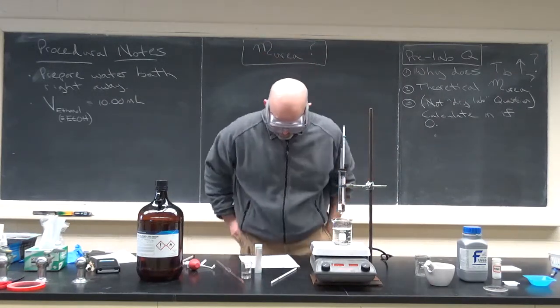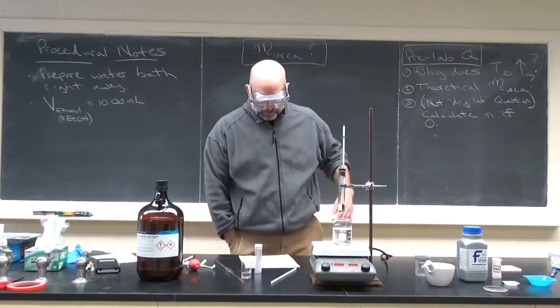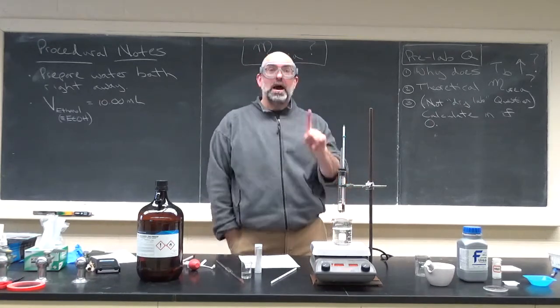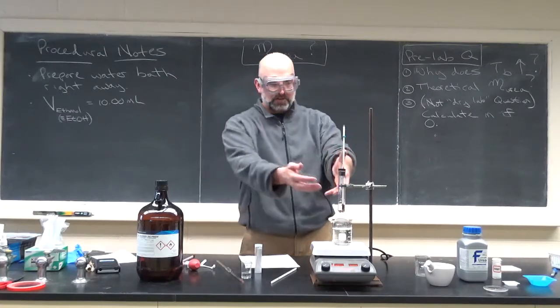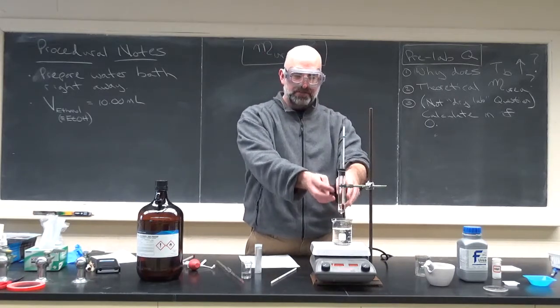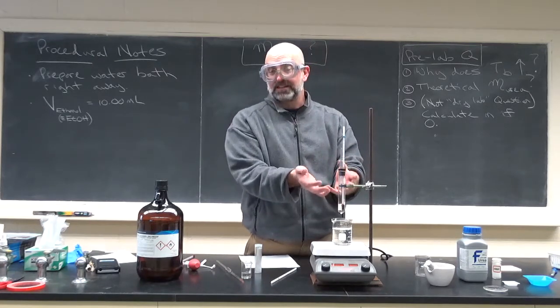Okay, so I think that's the procedure. Then it says remove this, and we're only doing one trial of each, I think. By the way, if you have to repeat it, it's really quick. Observations, observations, observations. If you see the ethanol start to boil and it's condensing all over the inside of the test tube and it's not staying in the bottom and you have droplets everywhere, which you'll have some, that's something you want to write down. That's a source of error.